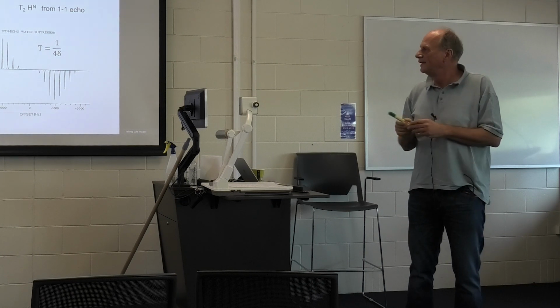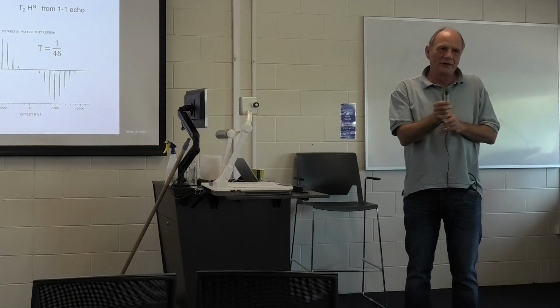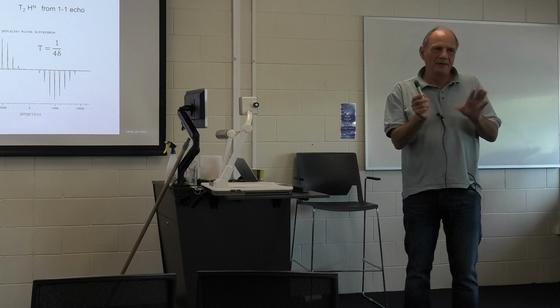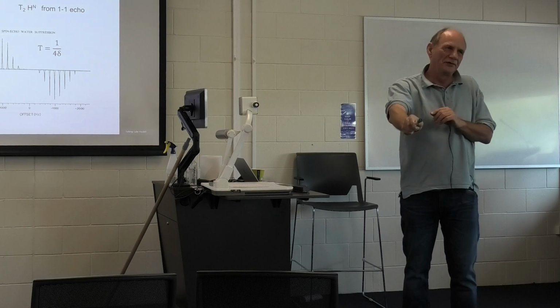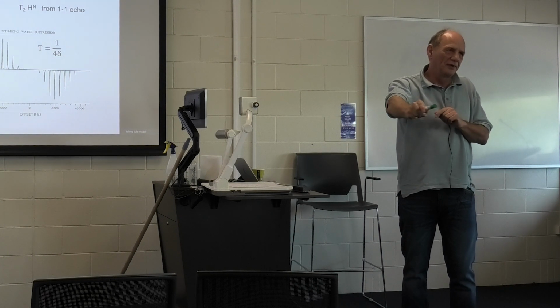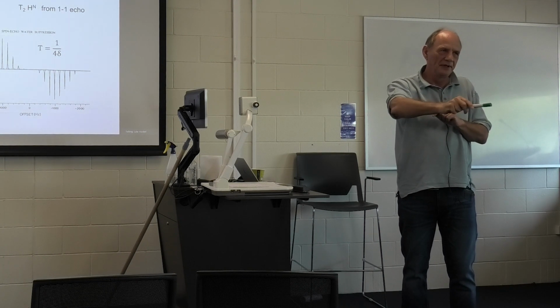But now you think of a resonance that is off resonance from water, and we are interested in amide protons, so 7 to 8 ppm. You go again from Z to minus Y, but now you're offset relative to 4.7 ppm.